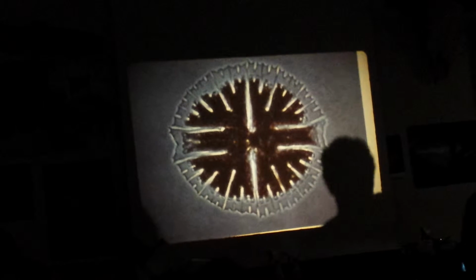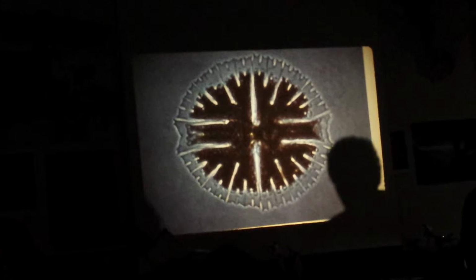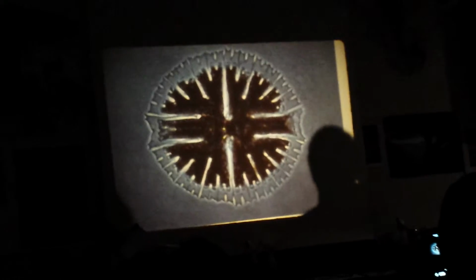Chloroplast is all the dark stuff, one giant. Nucleus is a darker spot right there in the middle. This one is not very healthy. Should be more green rather than dark like that.